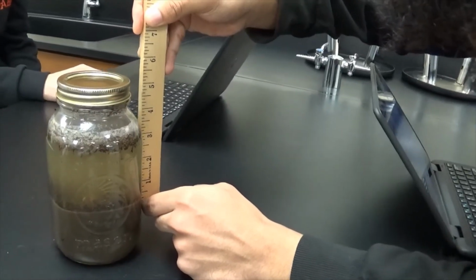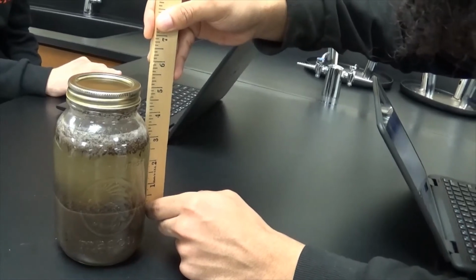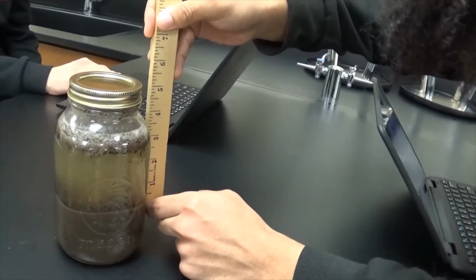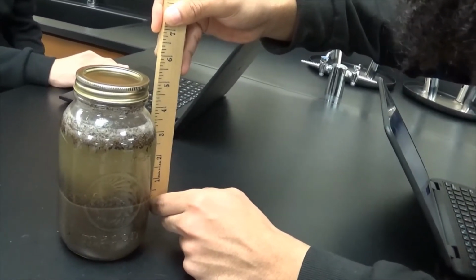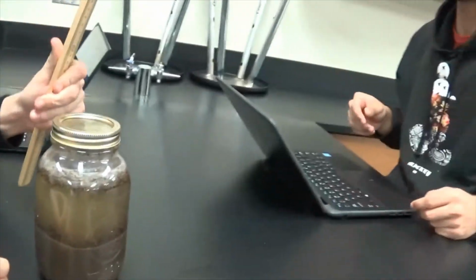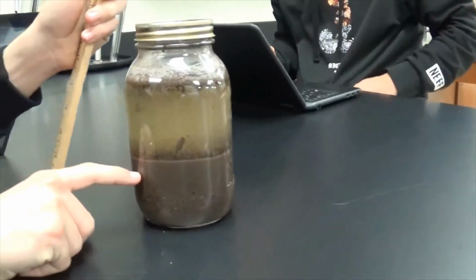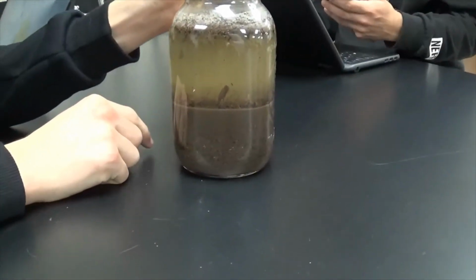Okay. Ethan, go ahead and measure the silt, see what you get, since you measured the clay. Because you know where the level is that you stopped with the clay.